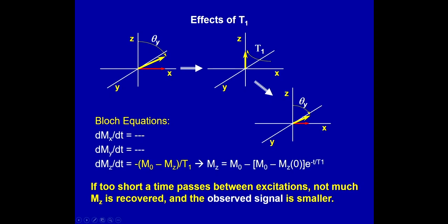Here is a general expression when we're talking about T1 relaxation. This is all we're usually concerned with, not all the other terms. And the general solution is this. The M0 is the net magnetization. This is NMR terminology. M0 is typically used as the net magnetization that you'd allow to develop after some time in the magnetic field. Mz(0) means whenever you start measuring, from 0 to some time t, where was the magnetization when you began tracking its fate?